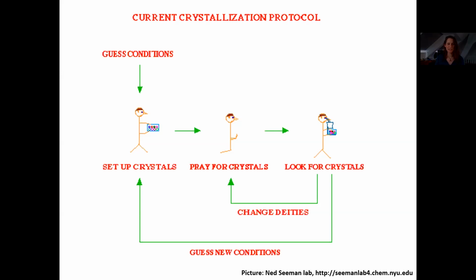And as you can see, there's nothing in this picture that says found crystals. And this is typically the first 2 to 3 years of any PhD thesis in macromolecular crystallography, where bouts of cell culture optimization, purification, and crystallization follow each other in a seemingly endless pit of despair.